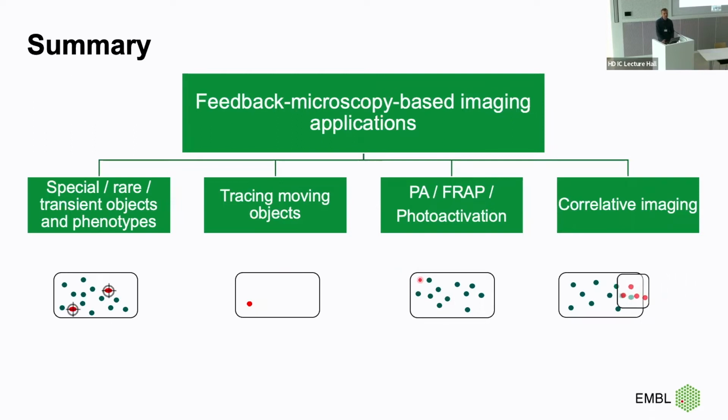So the same type of tools when we want to acquire low resolution, right? And instead of imaging high resolution on the same microscope, we might want to automatically identify a region and image it not with this modality, but transfer it to another light microscope, for example a super resolution microscope, or also electron microscopy, and so on and so forth.